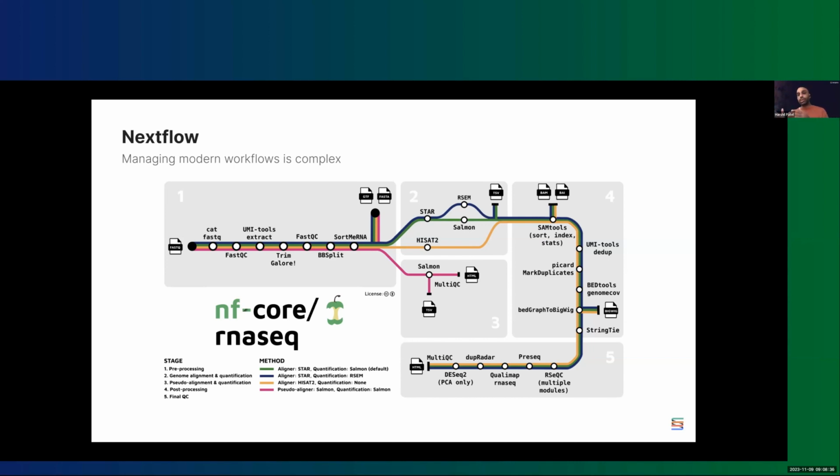And of course, it doesn't end there, because a list of differential genes then needs to be plugged into differential analysis software like DESeq, which then might need to be explored in an interactive notebook to make sense of your differential genes and so on. And so it's a series of steps, and you can see the whole data analysis lifecycle. And Nextflow really, as I said, changed the game in terms of the way that you write these pipelines.